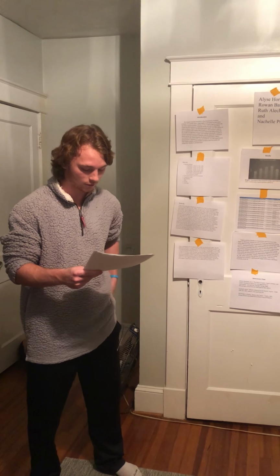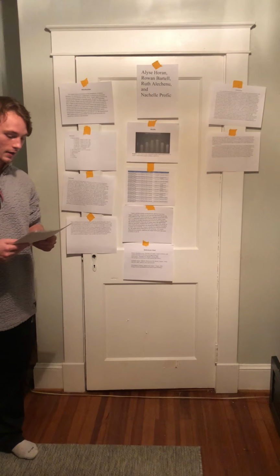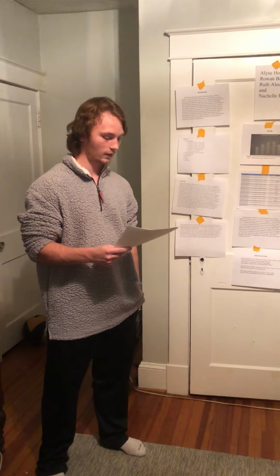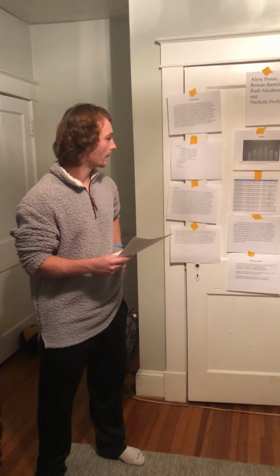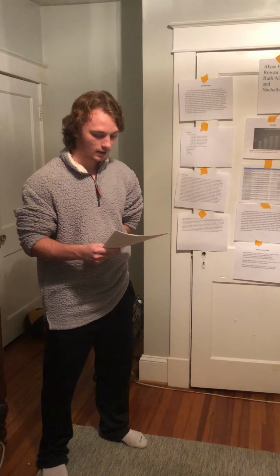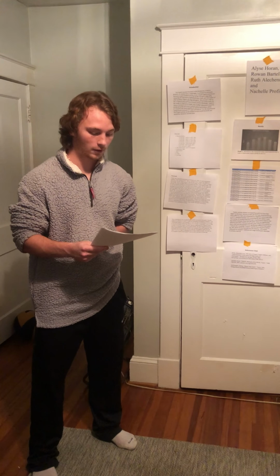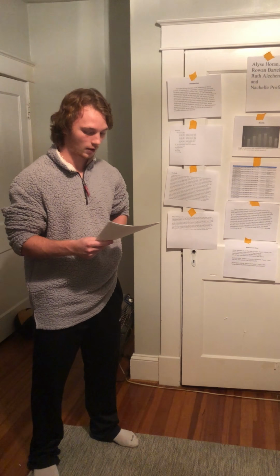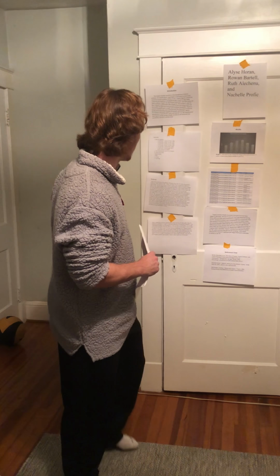Other sources of variation could relate to getting fingerprints on the cuvette that you use to read absorbance, or miscalculations that you could make yourself. The extent to which these things affected our data isn't concerning, due to our data being very consistent throughout our experiments and along with the other group that tested the effect of pH on trypsin activity. More replications in the future would help solidify our results and help determine how much these variations affected our results. And here's our works cited.